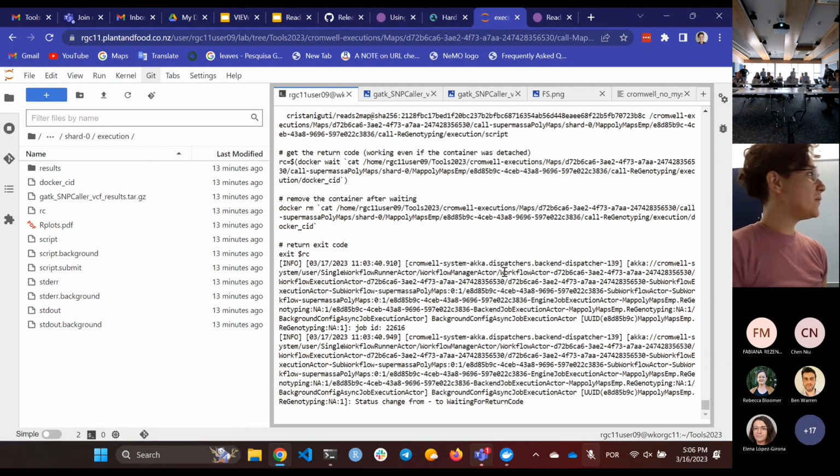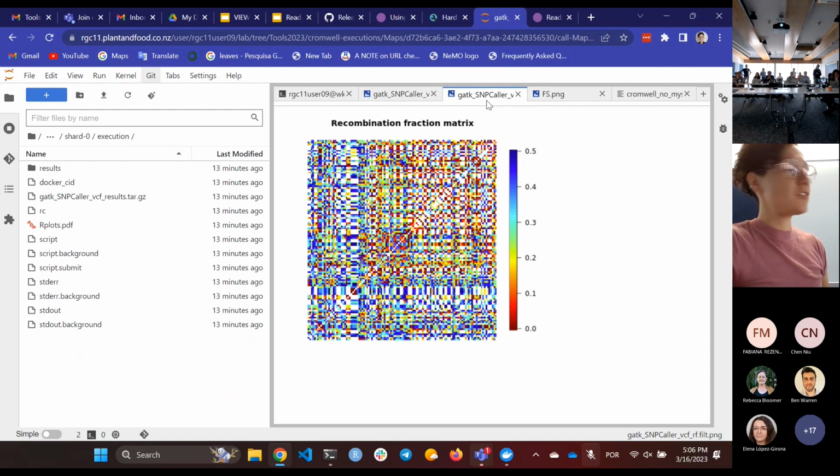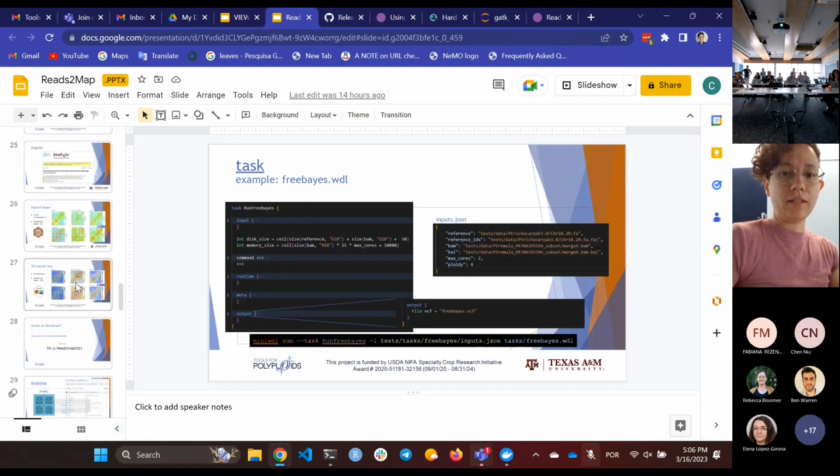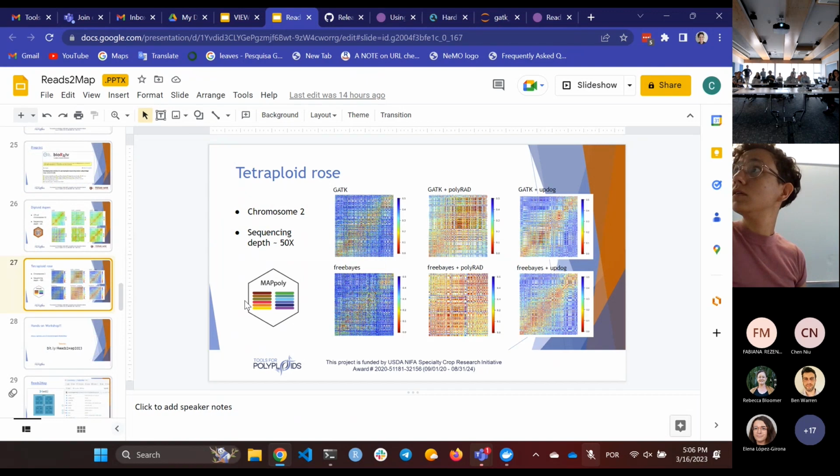I'm very confused. How do you read that heat map? Oh, this is a very messy heat map. How I read it is, it's not good. We should see something like this, something very visual and clear. If it's very different from this, it means don't use this approach.